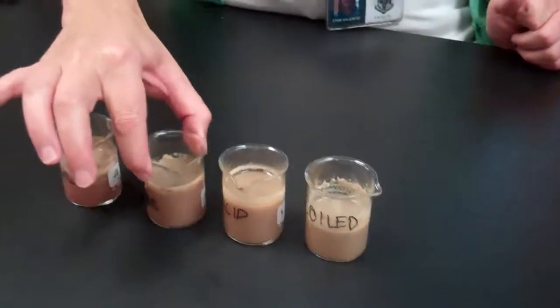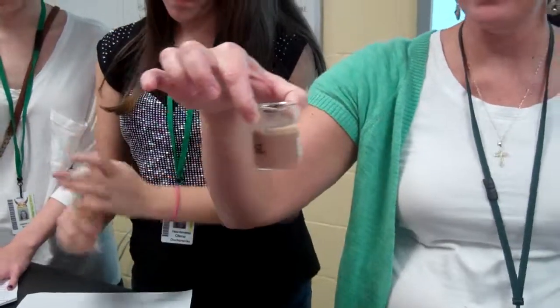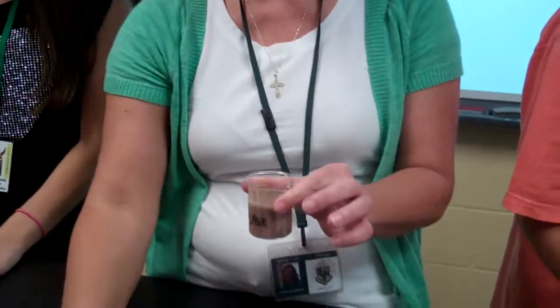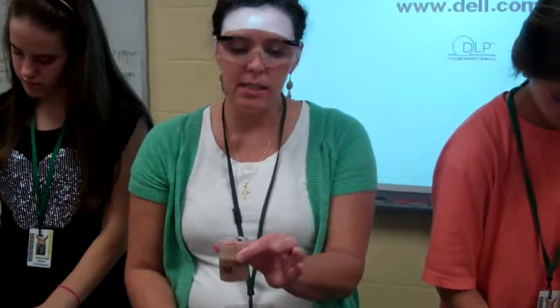All right, this next one is liver that has been soaked in a base. So I started out with raw liver and I poured sodium hydroxide on it and just let it sit. So can I put like base liver? You can put base liver. Okay, so this is liver that has been soaked in a base. And you can tell the color is a little bit different.